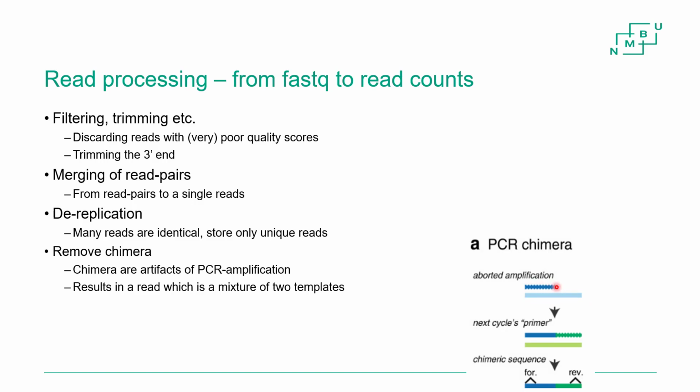Sometimes this copying stops halfway or something like that, right? For some technical or chemical reason, it stops here. So it doesn't end as a full copy. So this short one here will still float around. And then when the next PCR cycle is started, this one acts as a primer. Because it's a short sequence that floats around, right?